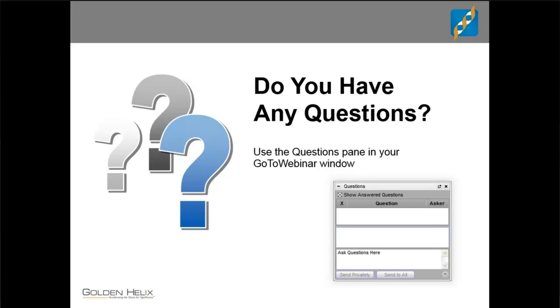You've seen it in SVS and it's going to be just as easy, and easier, to do in VarSeq. All right. As I look through the questions, I try to summarize a few of them. There are a few questions that came in that ask about the flexibility of this last workflow where you showed the five filters. To what degree is this a fixed aspect of our capability, or can we customize it? I think you touched on it in your presentation, but maybe you can speak one more time about how we can customize this for a particular situation.